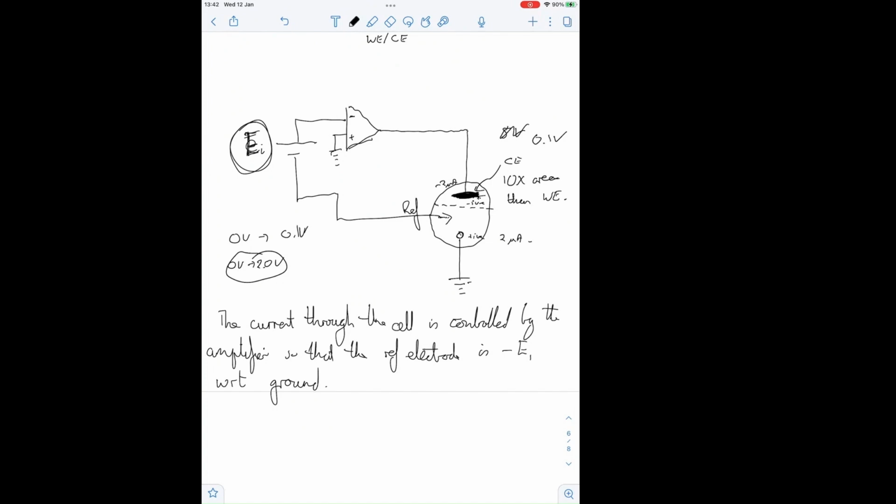Because I'm still seeing electroplating or something like that. So you'll still get plating, possibly, but it's gone voltage overload. What does voltage overload mean? Well, what a voltage overload actually means is that I've driven the potential of the counter electrode to the maximum possible, and still the current isn't such that the potential between there and there is the set potential.